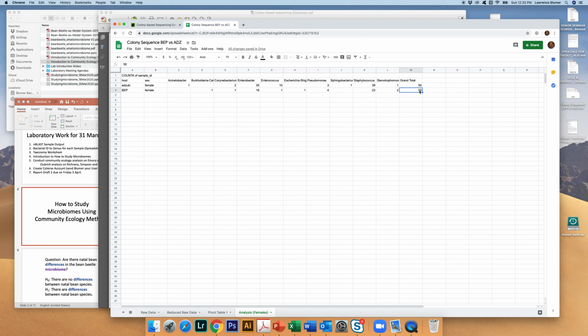And then do the same thing here, but you can save yourself some trouble. Just click on the upper cell which has that formula. You can see it right here, and grab the little box on the lower right and just drag it down. There we go. Okay, one more thing you want to do. The empty cells had no counts in them, so those should be zeros. Just enter zeros in those empty cells. So there are 2 there and there are 2 here.